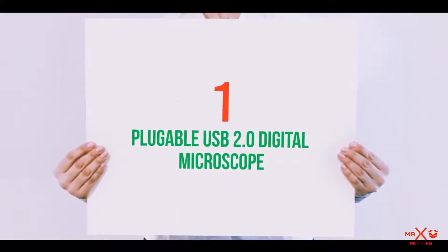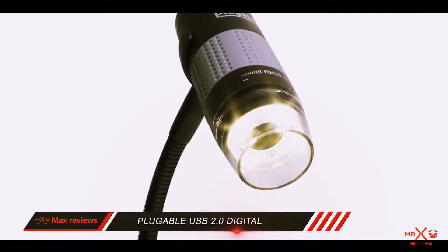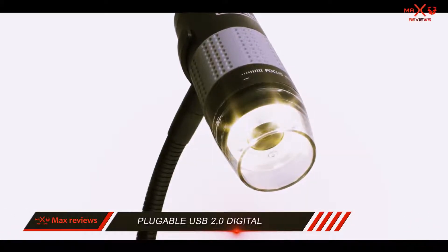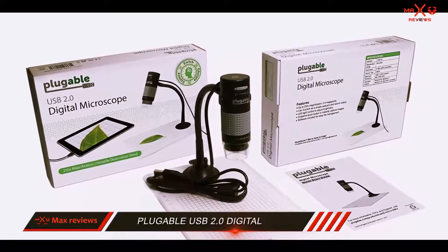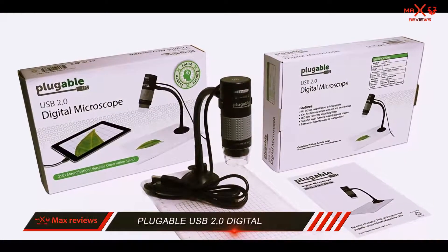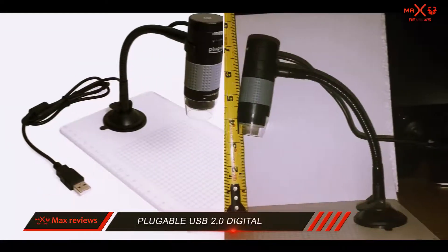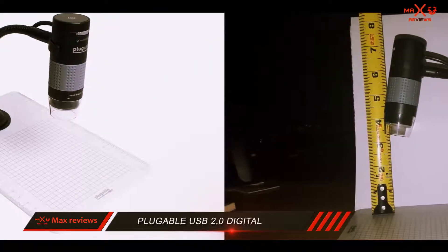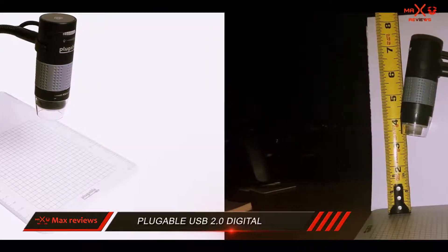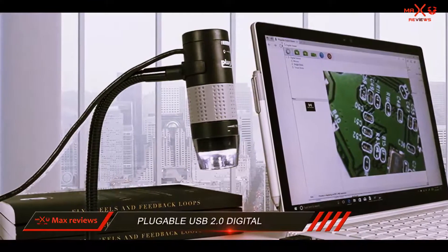And number 1 on this list: the Plugable USB 2.0 Digital Microscope. Featuring a 2-megapixel sensor, the USB 2.0 Digital Microscope from Plugable is one of the best microscopes you could purchase on today's market. Supporting a wide variety of operating systems including Windows, Linux, and Mac, this device is useful for students, testers, and almost anyone wanting an affordable USB microscope.